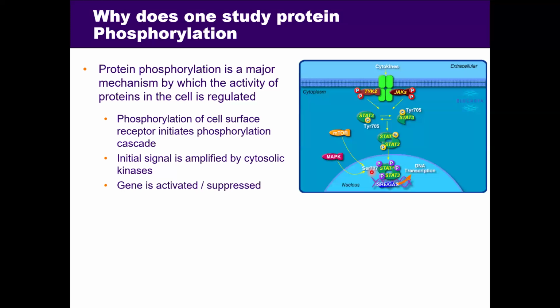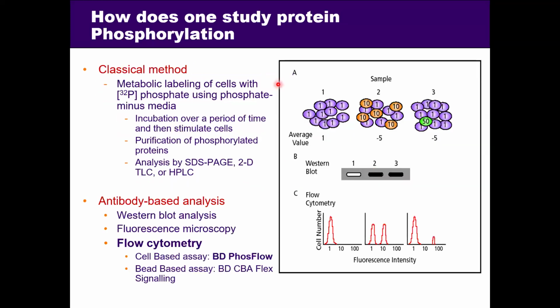Also, for example, a few people do the phosphate assays using the Western blot. For example, they check in the Western blot whether the particular cell got the phosphate or not using some particular antibodies. But these are the classical methods, as I was talking about, like they use SDS-PAGE or Western blot for the phosphorylation, right? And in the classical method, whatever signal you are getting is a whole signal.